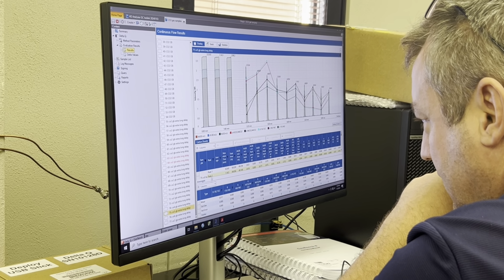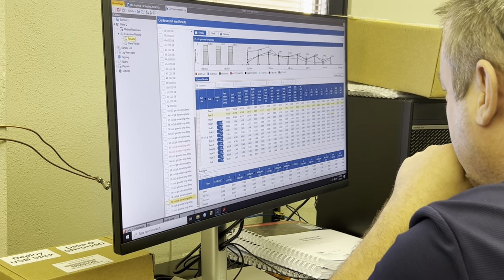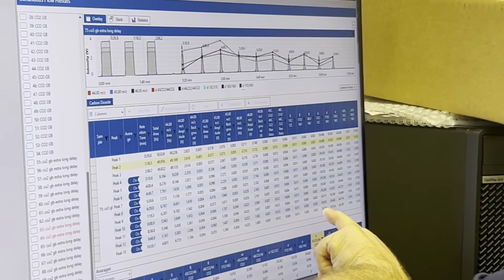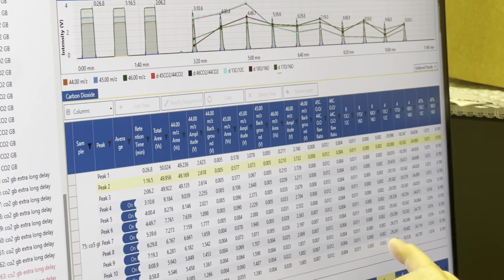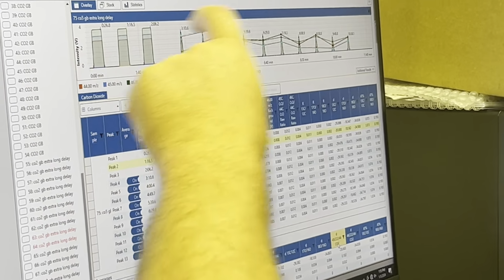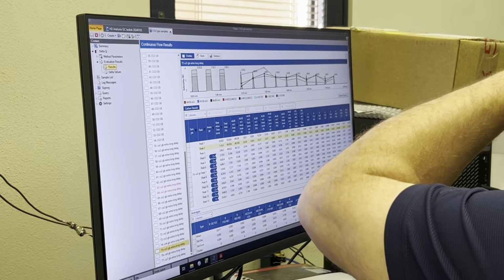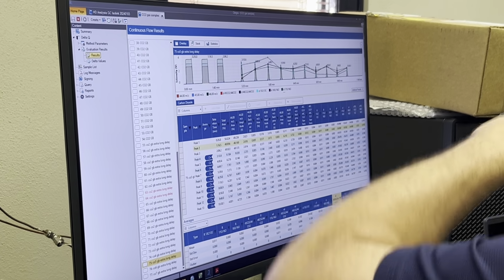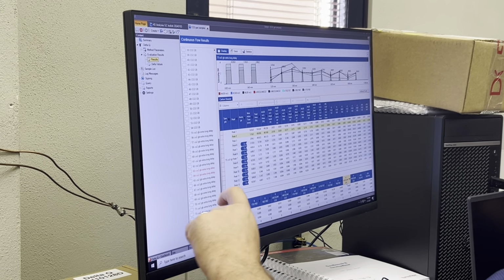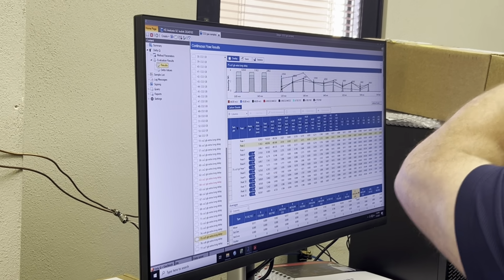Alright, let's get that there. So you can see the values are changing slightly over time. But if you take the average of that and compare it with the average of the standard, it's being treated in the same way, so it has the same depletion. This is one of the things we do: we take 5 of these samples, take the average, and calculate the standard deviation of the average.